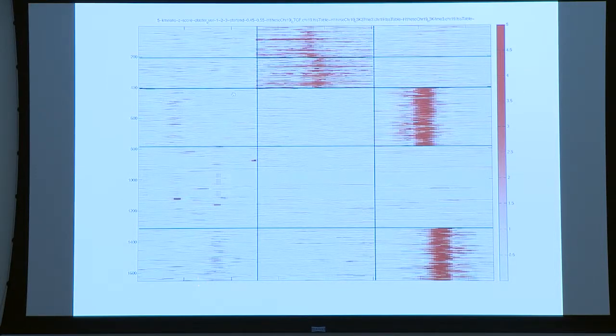So you have here the center. It's easier to see here. So here's the center that we defined, and then 2.5 kb upstream and 2.5 kb downstream. And the signal is the z-score, which means how much each area is enriched compared to the rest in each of the files.